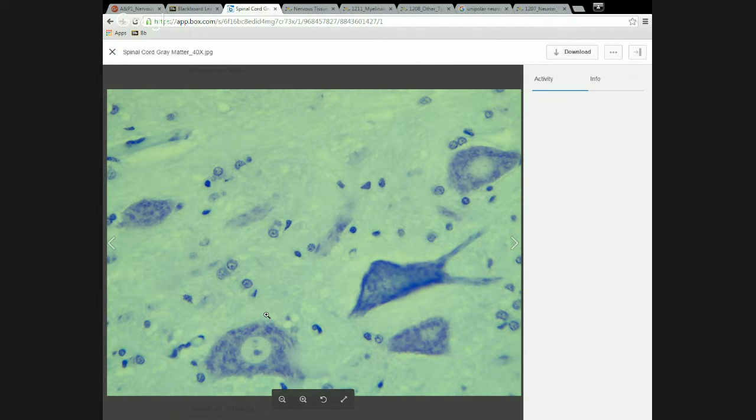Now, if ribosomes make proteins, what does it tell you when we see a cell that stains so darkly for specifically ribosomes? What is important about that cell? Ribosomes make protein. Dark stain saying lots of ribosomes. What does the cell do?